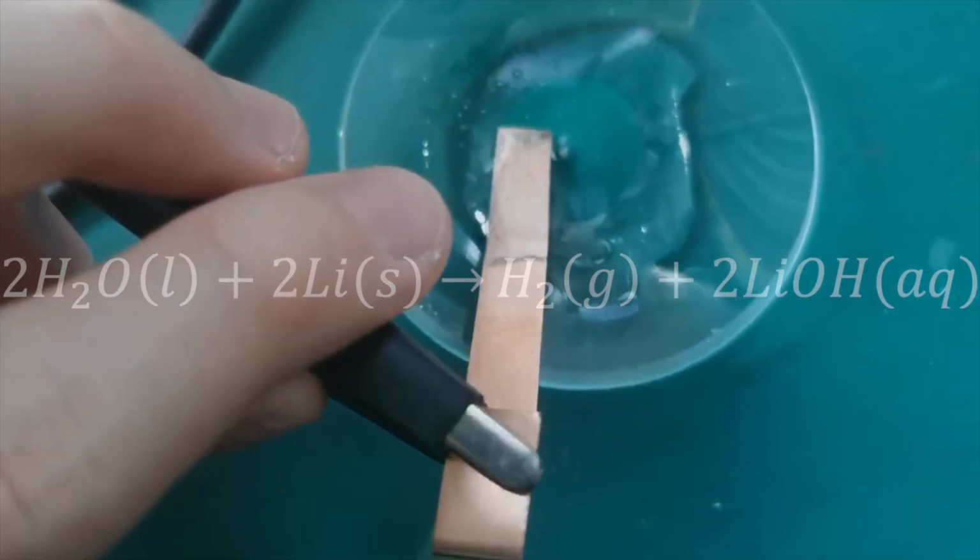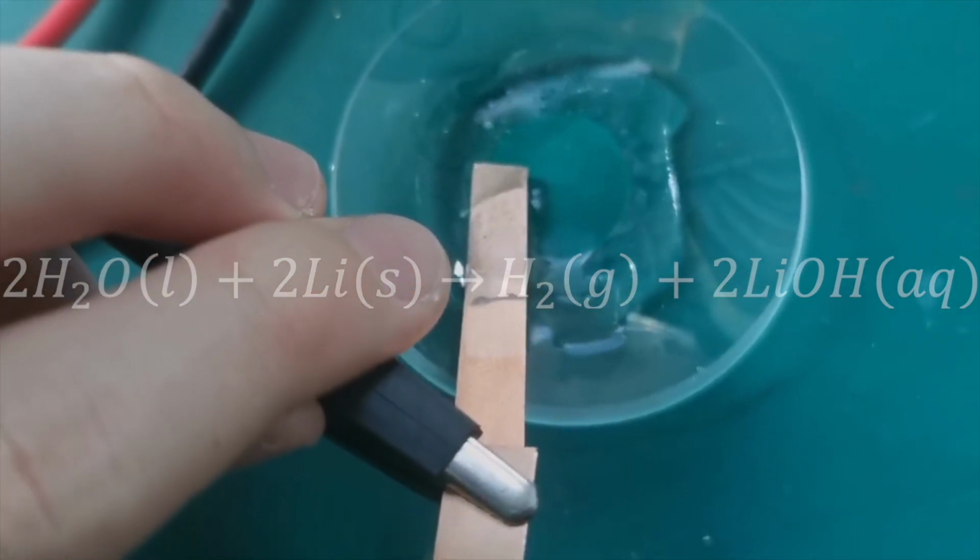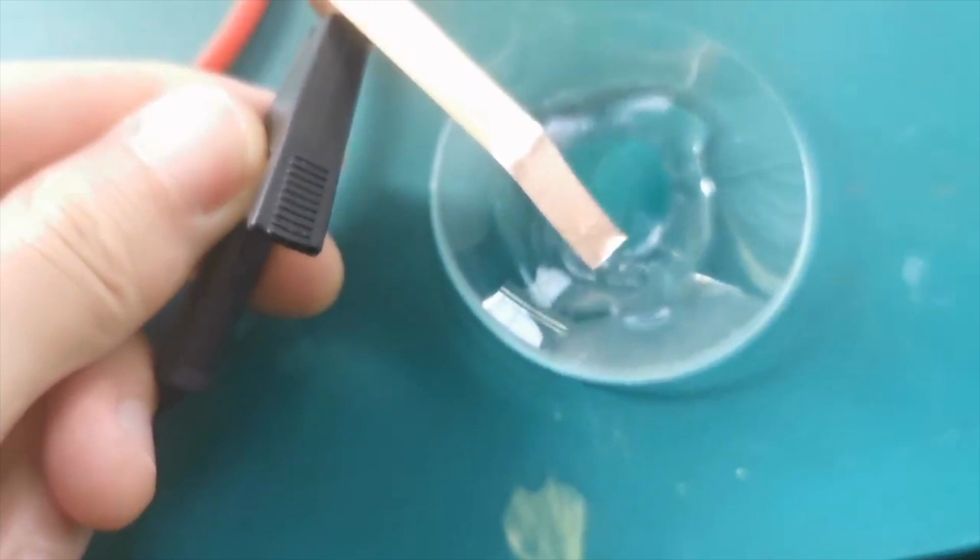Immediately, the thin layer of lithium reacted with the water to release hydrogen. Therefore, look, the experiment is successful. At least it actually gives lithium.